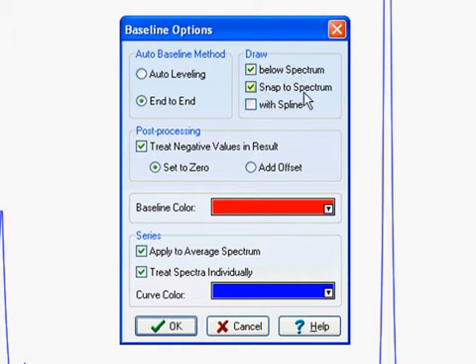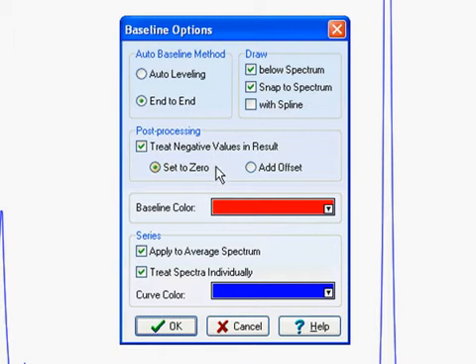Below Spectrum and Snap to Spectrum, both selected, will result in these additional points being picked. The other options offer different ways to treat the data and how to contend with a series of spectra. We'll leave the options unchanged and cancel the menu.